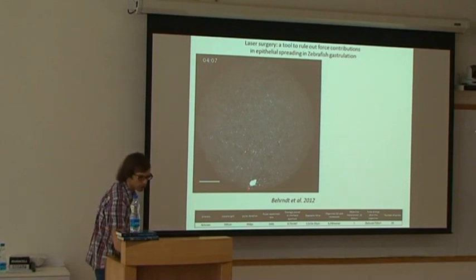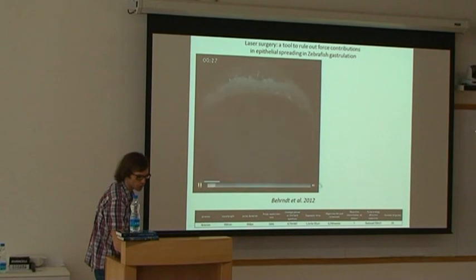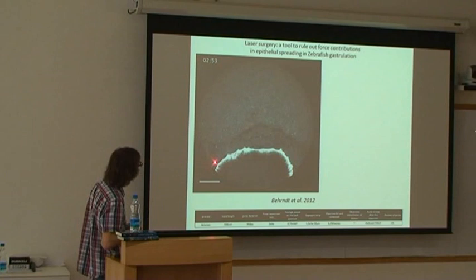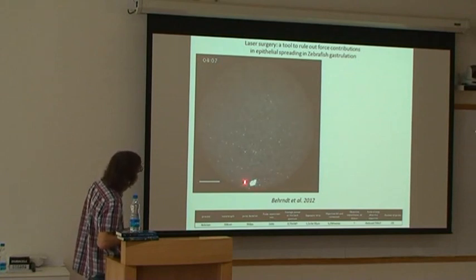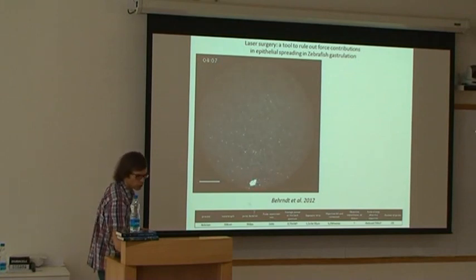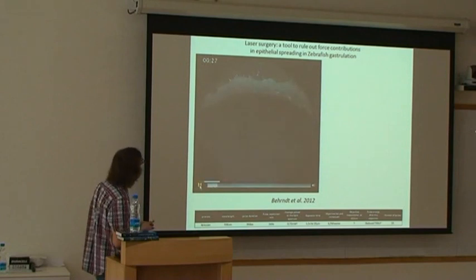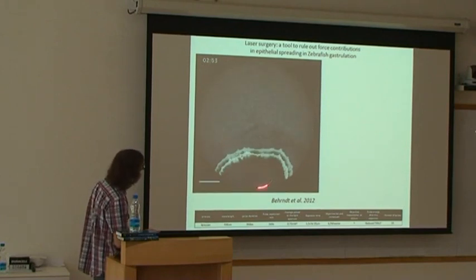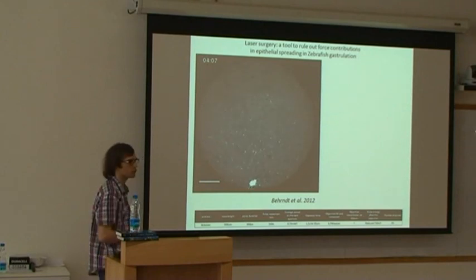In this movie you have myosin 2, or actin probably, which has been marked. He was very interested in characterizing this ring of actomyosin, which is at the border between the yolk area and the tissue area.